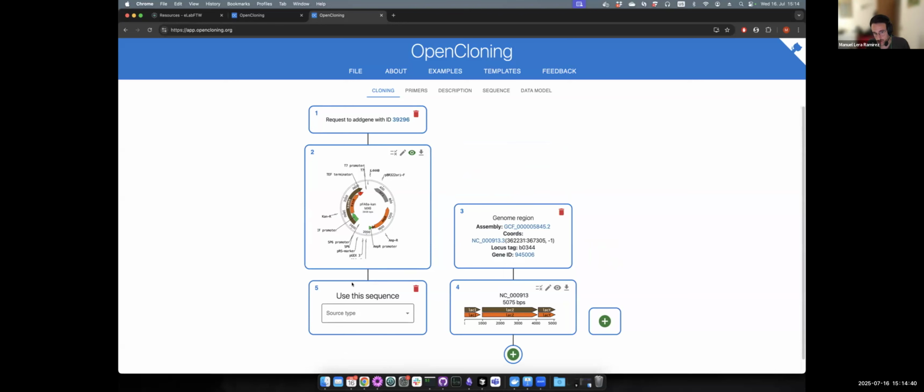So what we would do back then, if we wanted to delete this gene, for example, was amplify this resistance cassette with a PCR, and then add some homology to the primers, some tails to have homology, and replace something in the genome. So let's imagine that's what we're going to do.